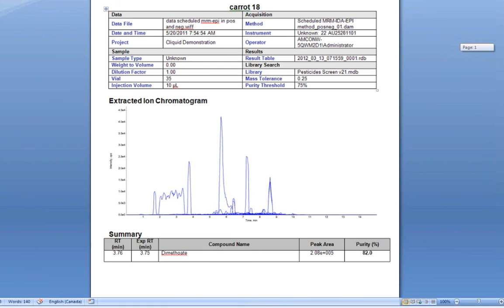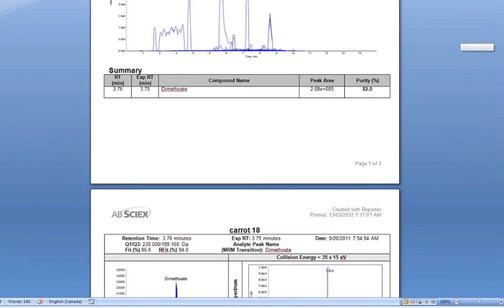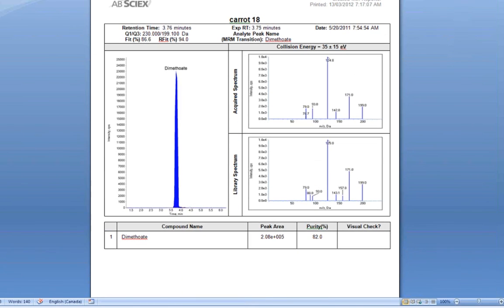In my carrot sample, we can see that I have one positive hit. This is for dimethoate.